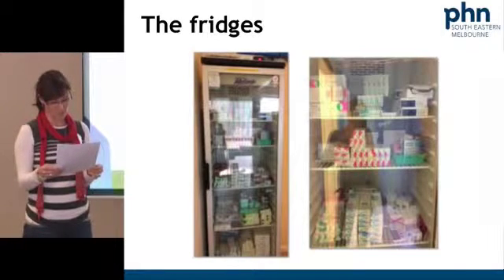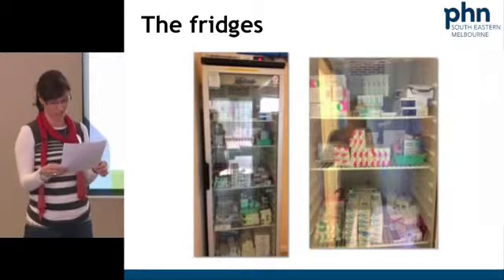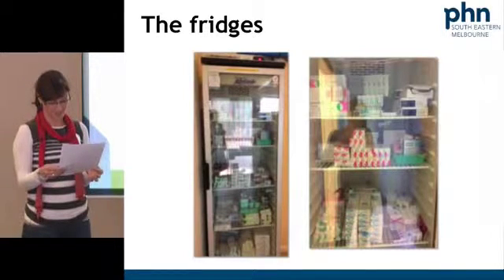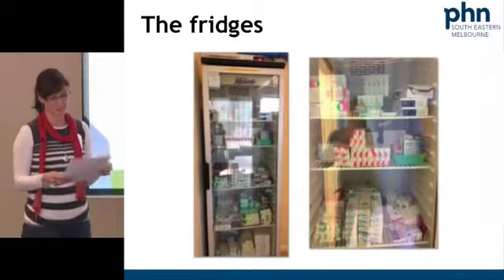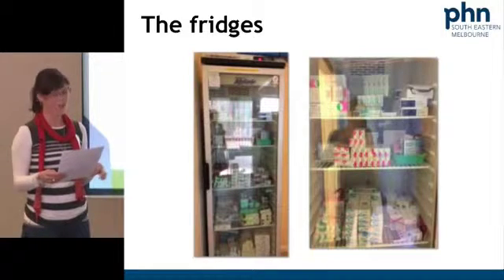If the temperatures were to be adjusted to the best on the controller, the minimum maximum would be a long way off, therefore affecting the efficacy of the storage of vaccines. They also stated that the data logger, which we upload and download every week, is currently connected on a probe that is in the same place as the controller and the minimum maximum display. It was stated, therefore, that the data logger is also not recording the correct air stock temperature and cannot be relied upon to save stock in the event of a failure.